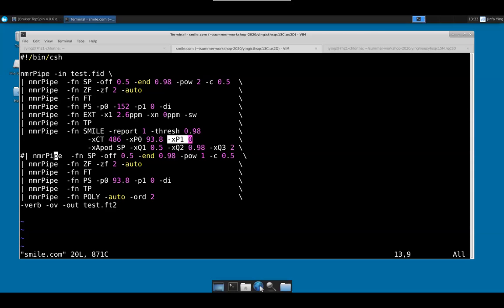Yeah, I think the default is... There's minus 90, 180 also. Phase correction where you have a half dwell delay introduced into the T1. That will be 1, yes, because the linear phase is 180, yeah. Yeah, 1. Okay. So yeah, it's important. Otherwise, you get a baseline problem. Correct. The zero order and first order, 180 and minus 90, or some combination of that. Yes. Depending on how it's acquired. It's completely depending on P1.